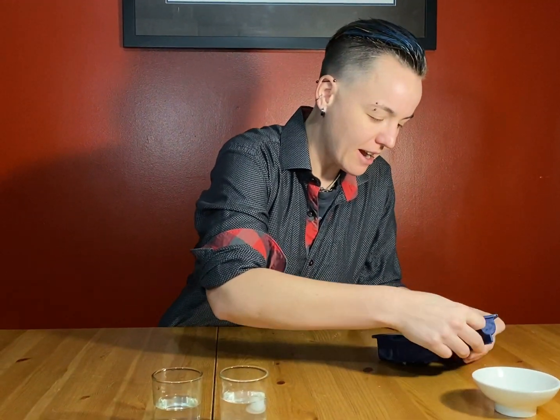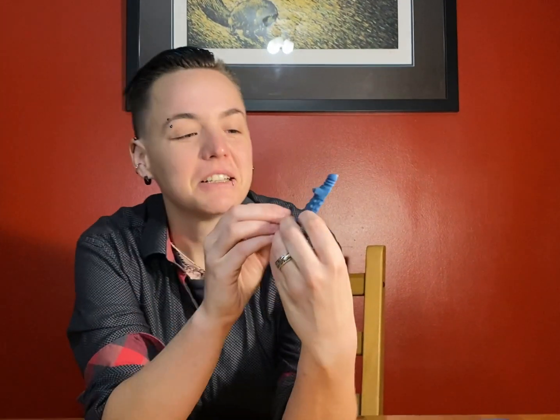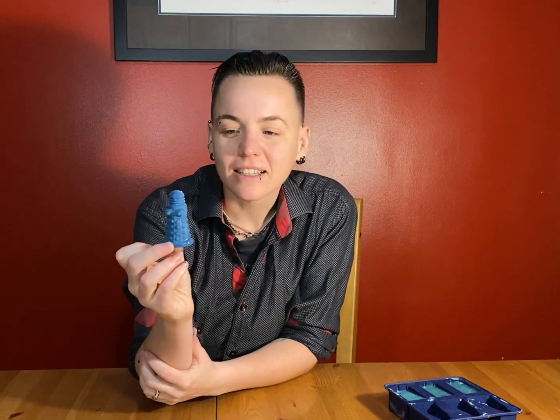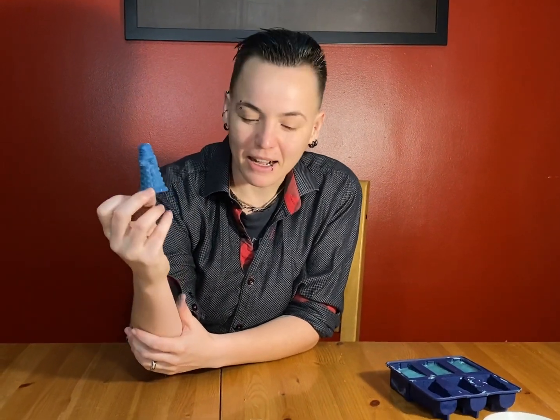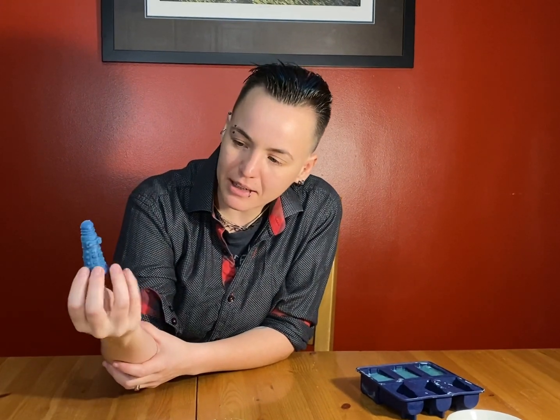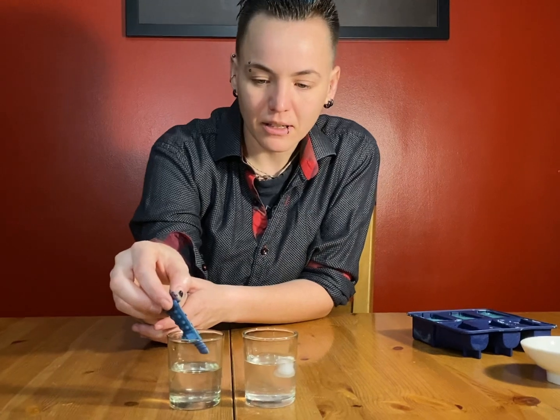So right here I have some frozen solution, which is in the shape of Daleks from Doctor Who. If you don't know what that is, then you ought to watch it. So what we're going to do is add this Dalek ice cube into this solution, and we're going to see what happens. We can observe that it's kind of this bluish color. What happens when we add it to vinegar?